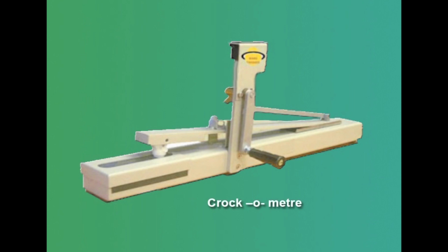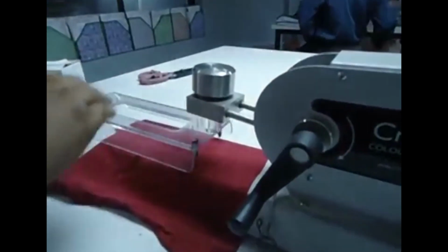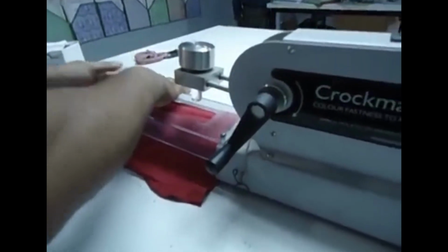This test determines whether or not color may be transferred from the surface of the dyed textile material to other materials by rubbing, and also the color change that happens to the dyed material. Two specimens are required to finish this test, one for the dry test procedure and one for the wet test procedure. The test specimen, lengthwise colored fabric, is selected and placed on the base of the crockmeter, that is, on the flat surface.